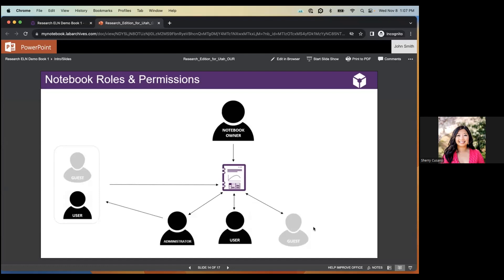The user role is the most commonly used access role in Lab Archives. By default, a user has read and write access to the entire notebook, and users are typically the main bench lab members. The administrator role also has read and write access to the entire notebook, but additionally has the ability to share — meaning they can add other users and guests to the notebook. Administrators are typically lab managers or supervisors.